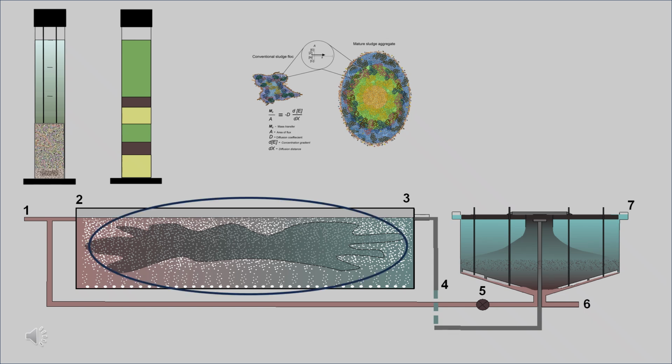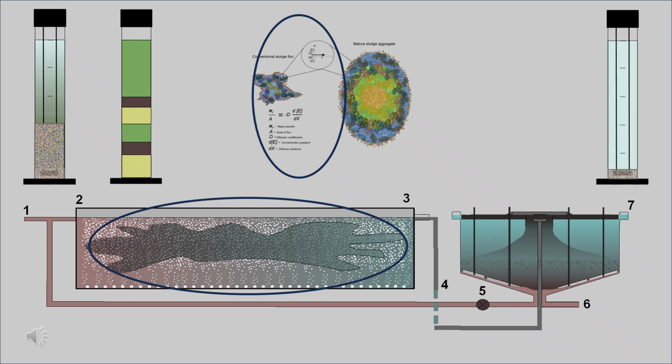The fractions of solids in the wastewater transfer to the biomass with different efficiencies, and the COD measurement of the final effluent, point 7, will give a good estimate of the overall performance of the process in removing the pollutants. The different transfer efficiencies of the fractions in the wastewater sample cause the change in the mass per volume percentage fractions, shown for the final effluent sample.